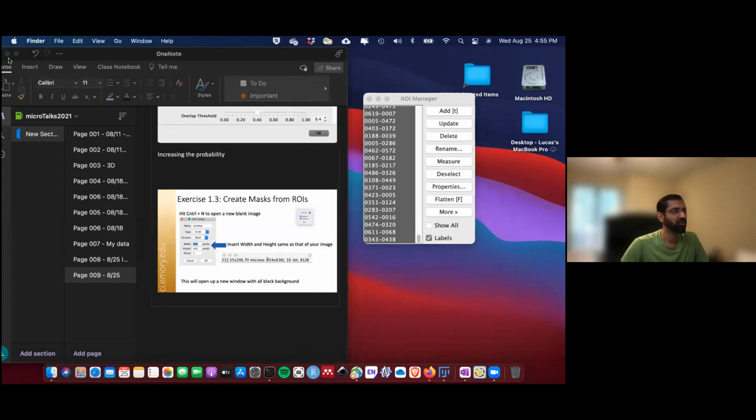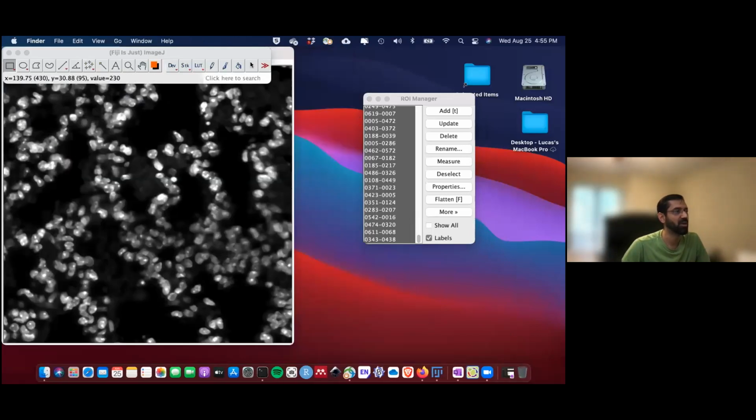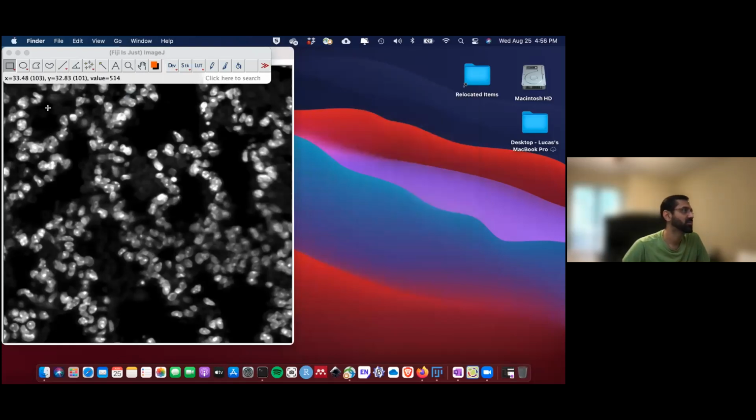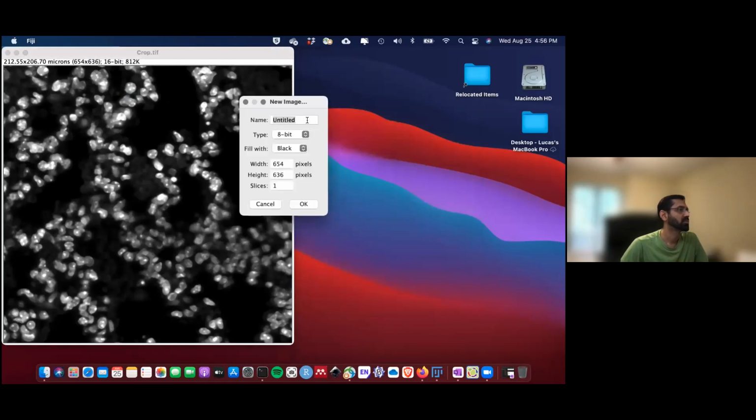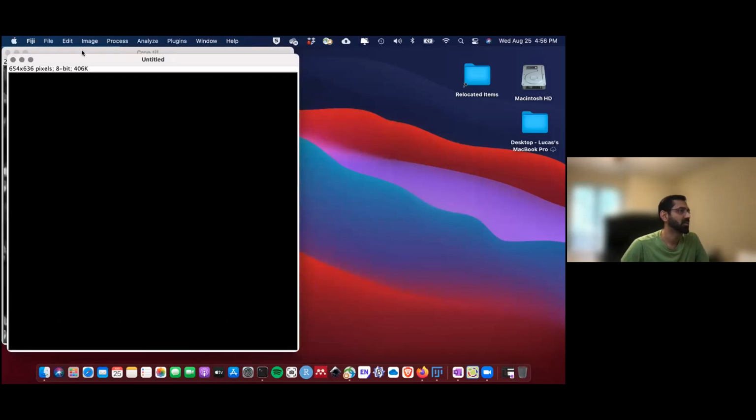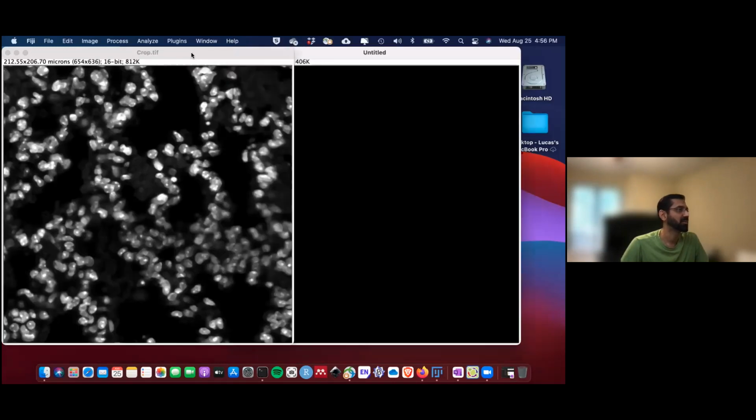Okay, and then you can also close this ROI manager. Let's close the ROI manager too. This guy? Okay. Yeah, just close it. So let's go like this. This is what I generate, right? Yeah, 6.5. Yeah, perfect. Oh, but you will need your ROI manager. So you might have to go back and redo the StarDist thing on your crop.tiff again. Yeah, so let's run the StarDist again.